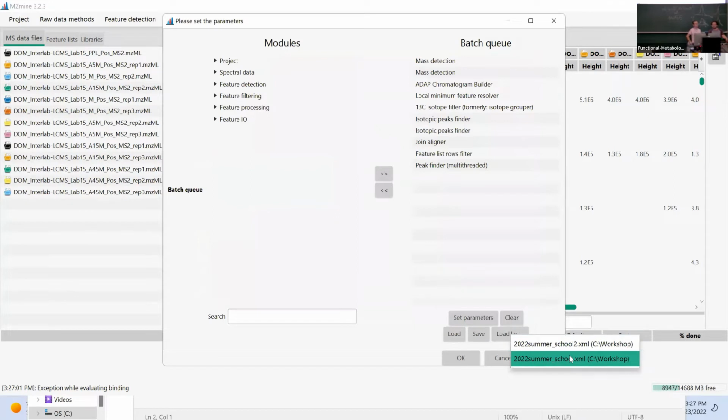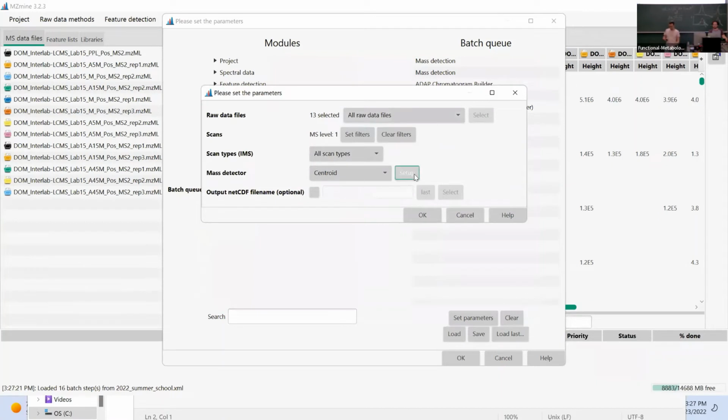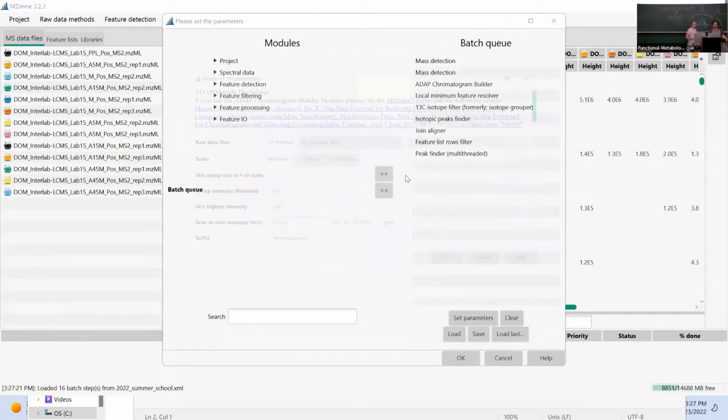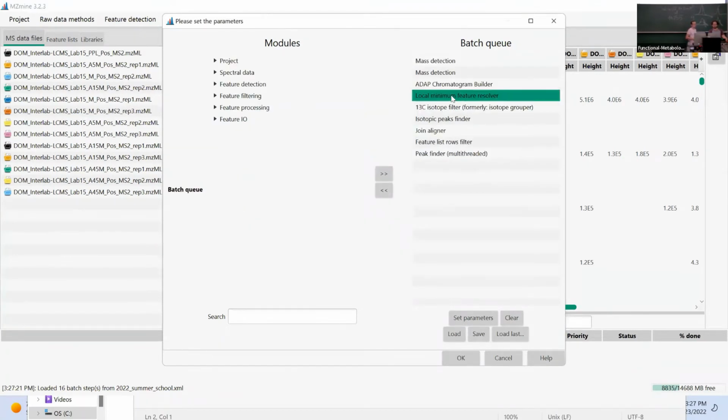Yeah. Yeah. That's maybe. Yeah. I guess they're going to say that afterwards. Yeah. But then they have to download first, and right.